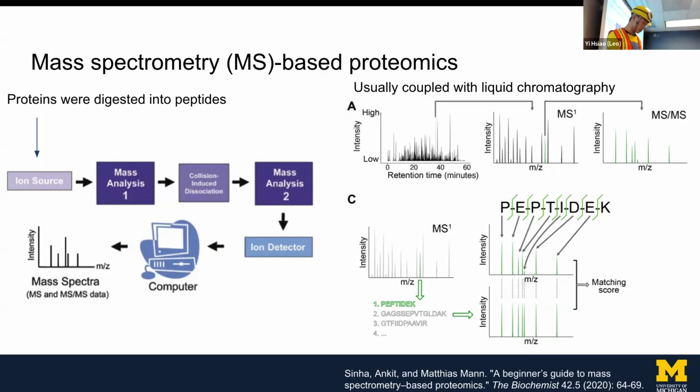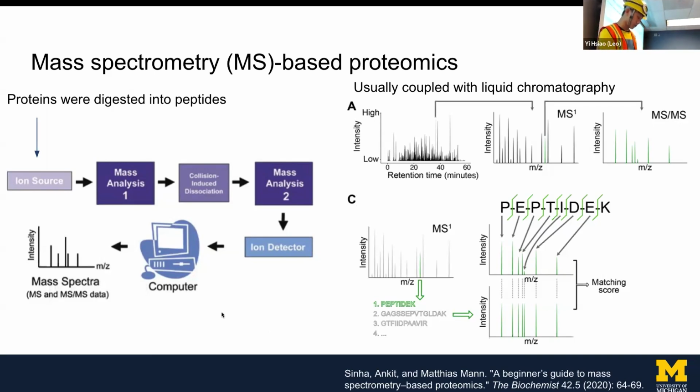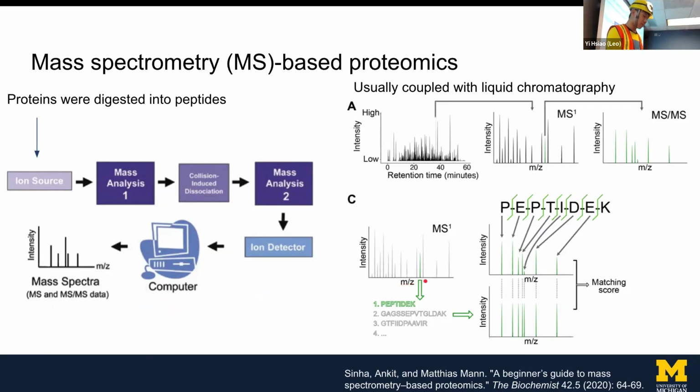This peptide will get further sequenced, as you can see in the lower panel here. And on the laser pointer, I feel like this might be easier to see where I'm pointing.